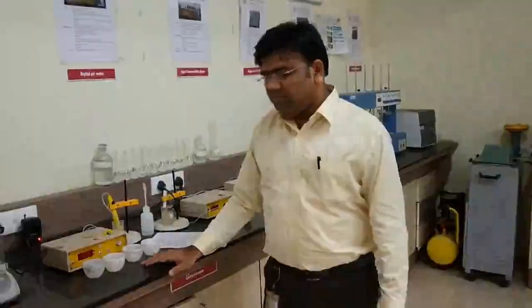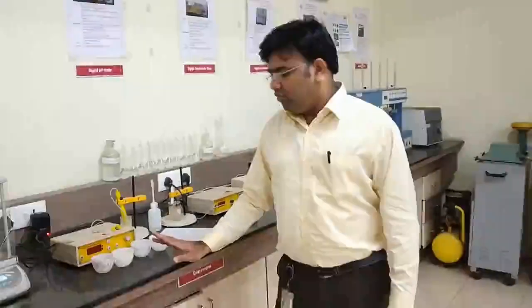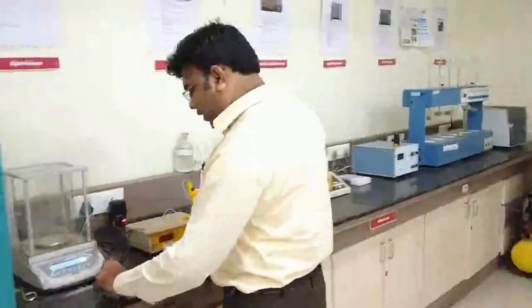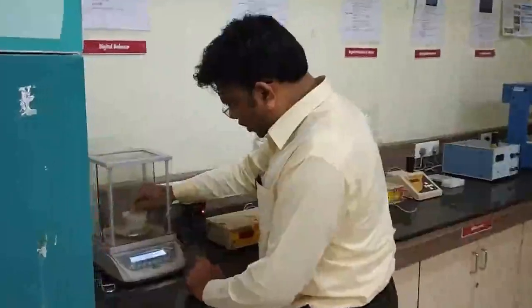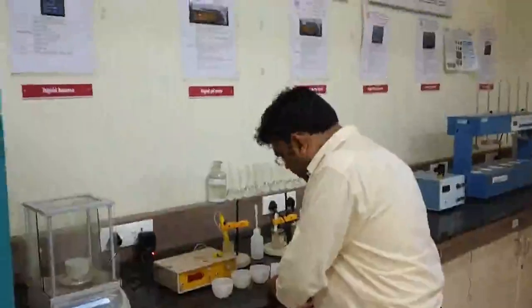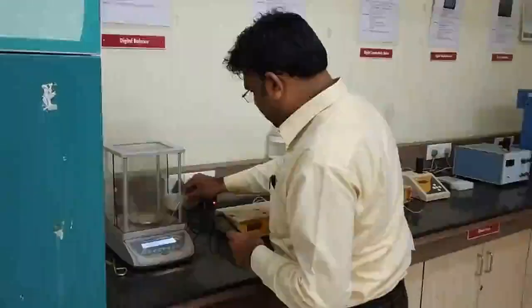So we have cleaned these crucibles, we have washed them, and we have dried them in the oven, right? And then we are going to take the empty weights of the crucibles. The empty weight of each crucible is to be noted. So I am going to note the empty weight of all these crucibles. Crucible A has an empty weight of 48.862 grams. Right? Even the unit is important.